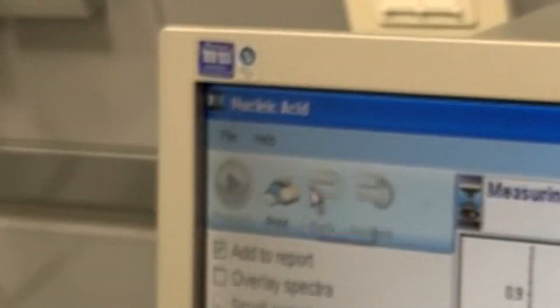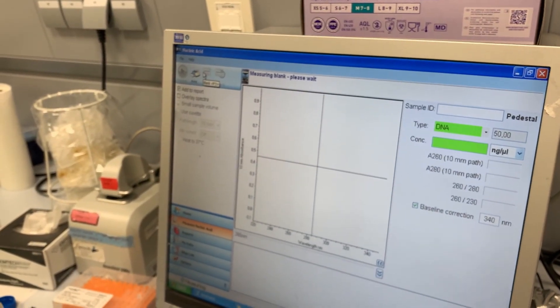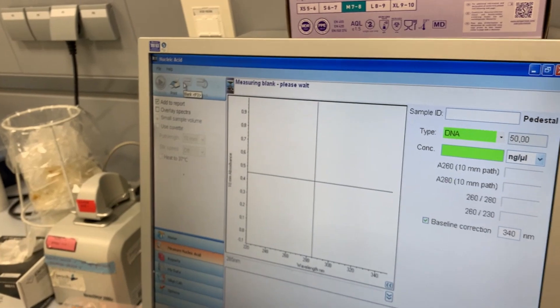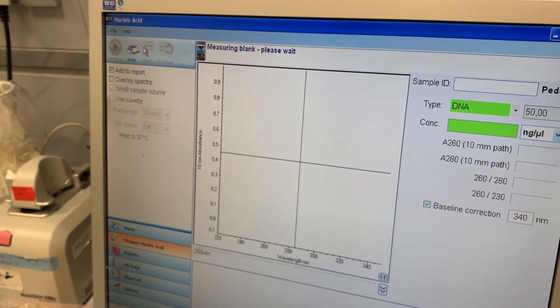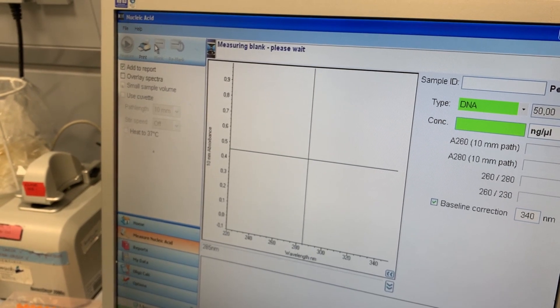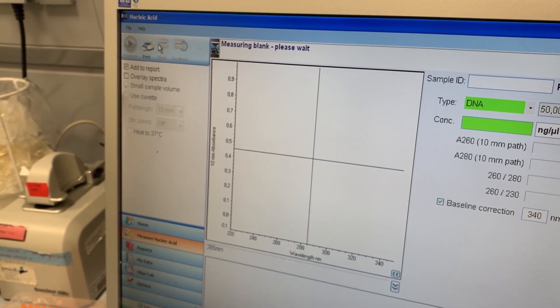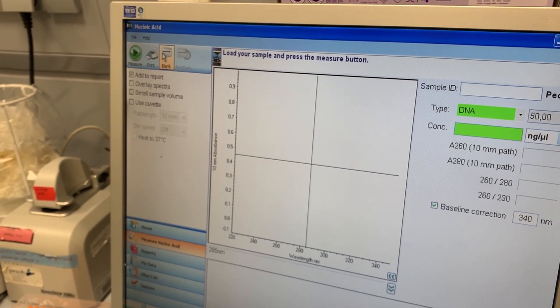And then you are ready to blank. Now we are ready to measure.